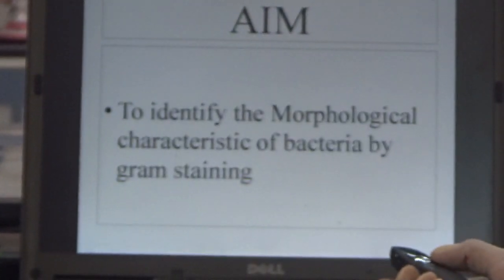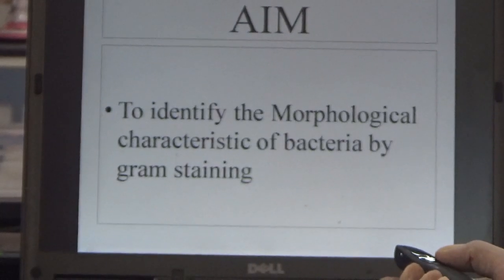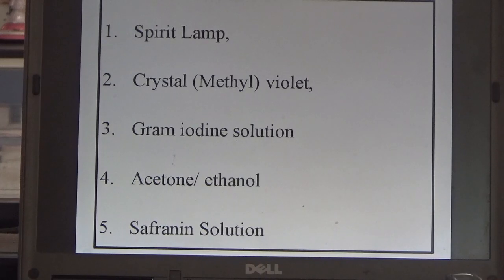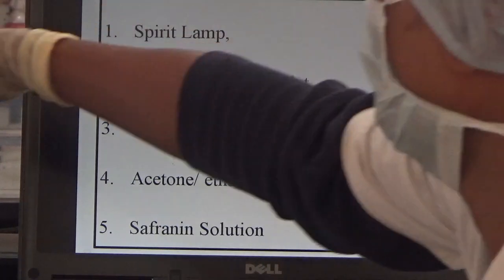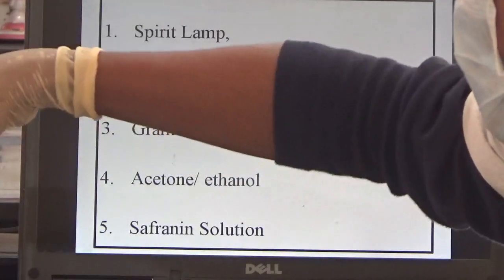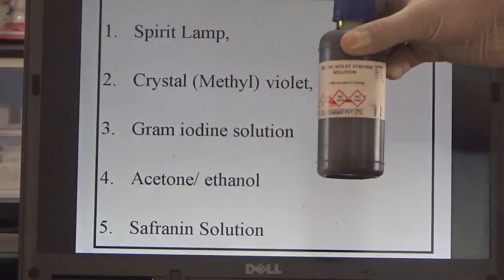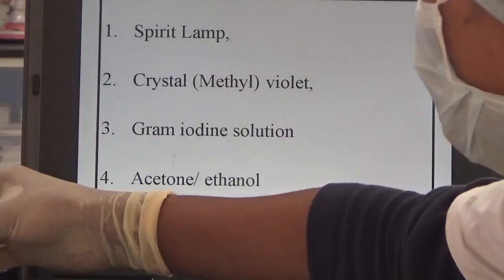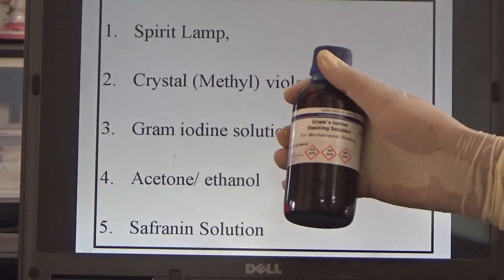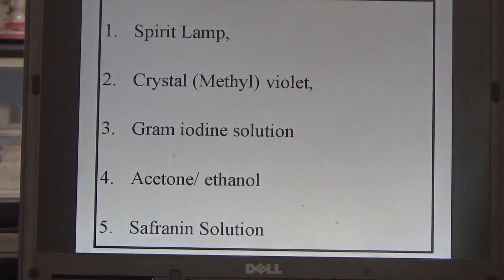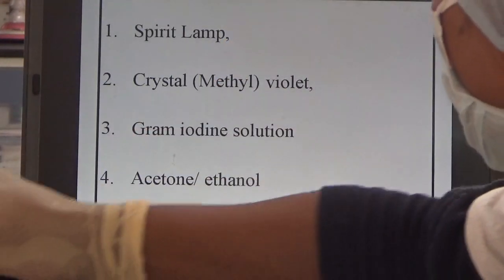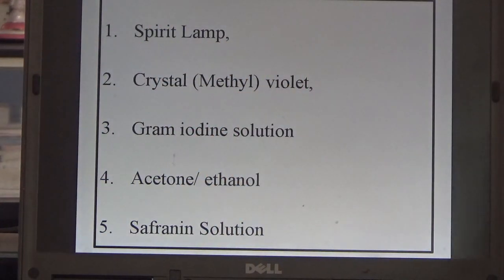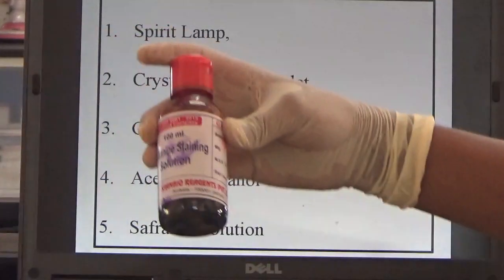The aim is to identify the morphological characteristics of bacteria by Gram staining. Requirements: spirit lamp, crystal violet, Gram iodine solution, acetone, ethyl alcohol or ethanol — here we use alcohol — and safranin solution.